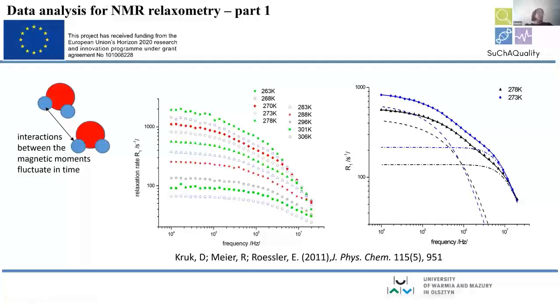If you take the very simple equation for relaxation, which I will present in a couple of minutes, then one can generally say that the relaxation rate reaches its maximum when the time constant is equal to 0.6 reciprocal resonance frequency. This comes from the math, but this is for the simple idealistic case. Generally, I want to say that at lower frequencies, slower dynamics manifests itself more as the dominating relaxation contribution. What you see here, is it clear? Okay, thanks.